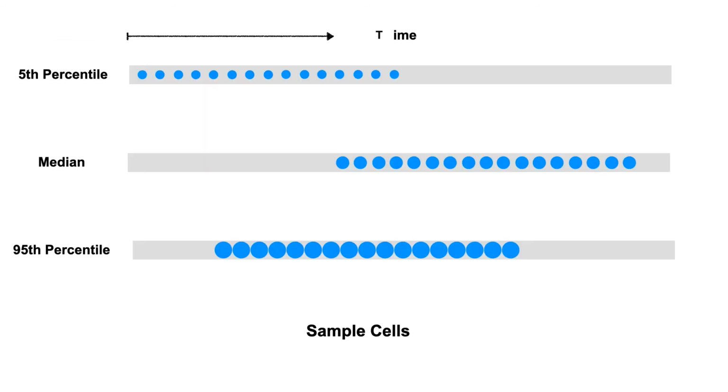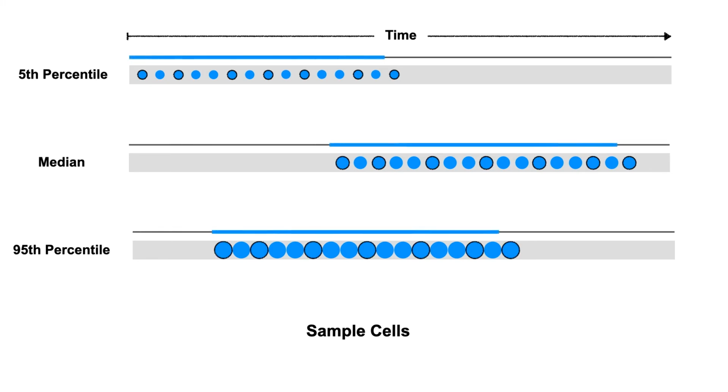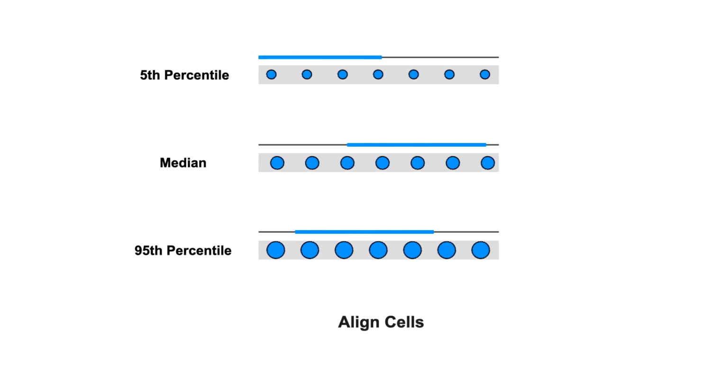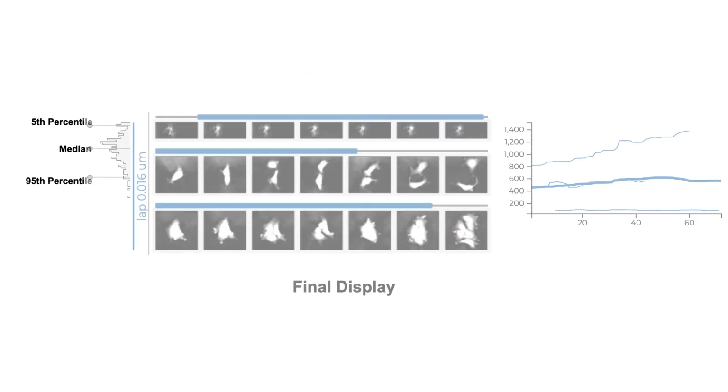When aligned strictly by time, these tracks can be very long. To address this, we also sample individual cells over time. In addition, we keep track of the lifetime of the cell within the experiment and show it as a bar above the exemplar. This way, we can realign the tracks while preserving the temporal context of the cell track. This is how this looks in Loon.